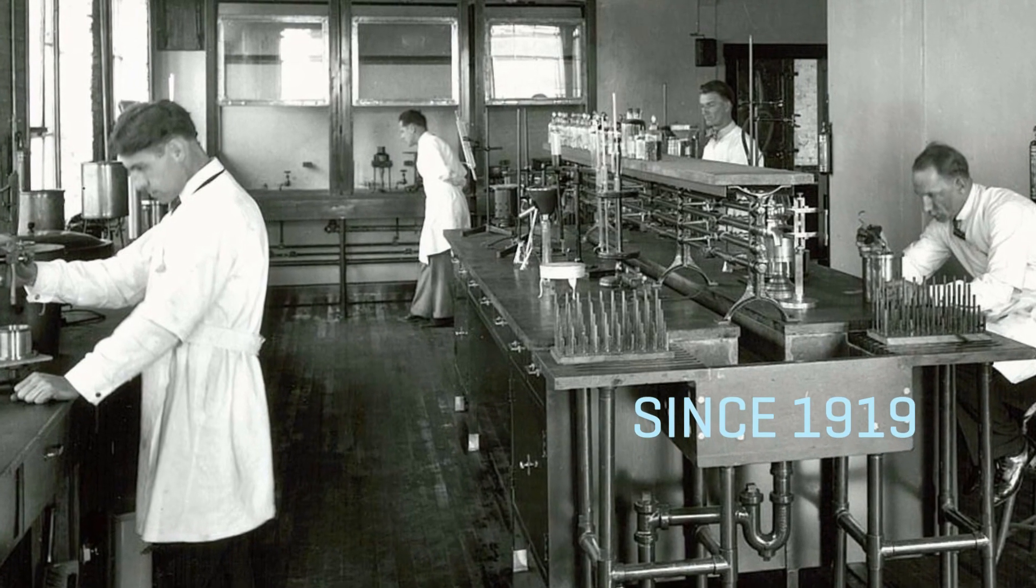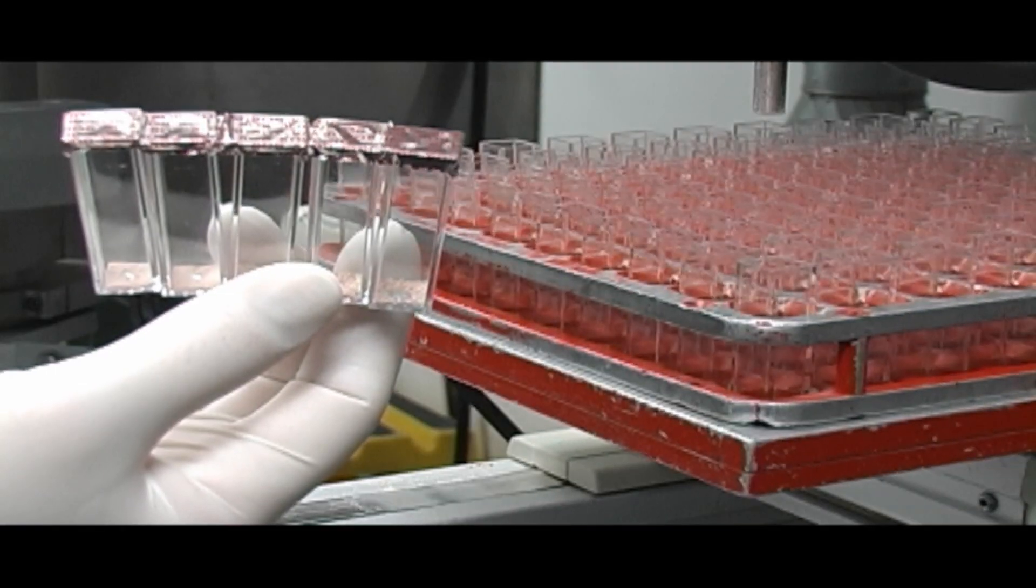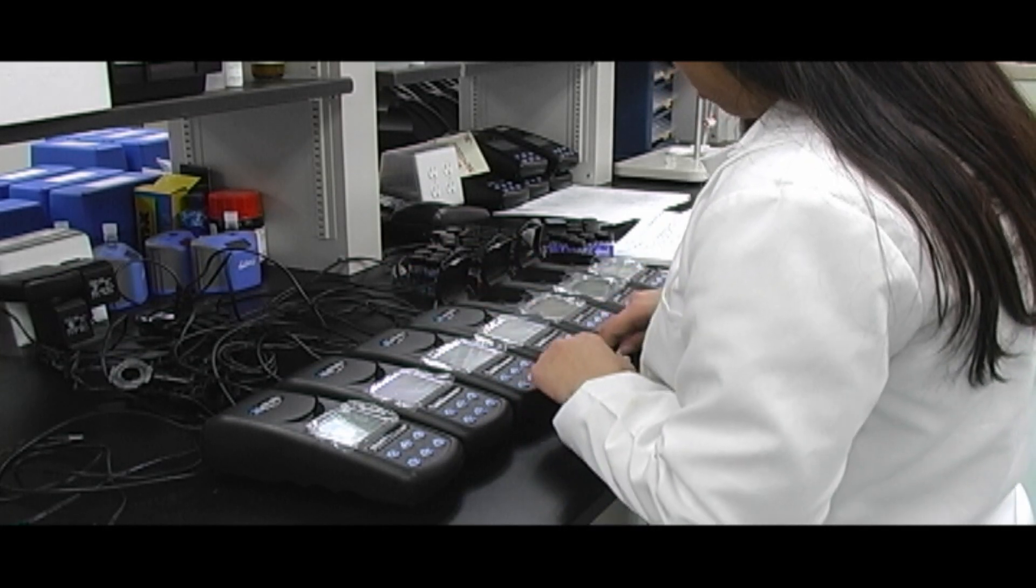Since 1919, Lamont Company has specialized in simplifying water analysis, with everything from unit dose reagents to test strips and handheld photometers. But today's world is faster than ever, and accurate data is needed immediately.